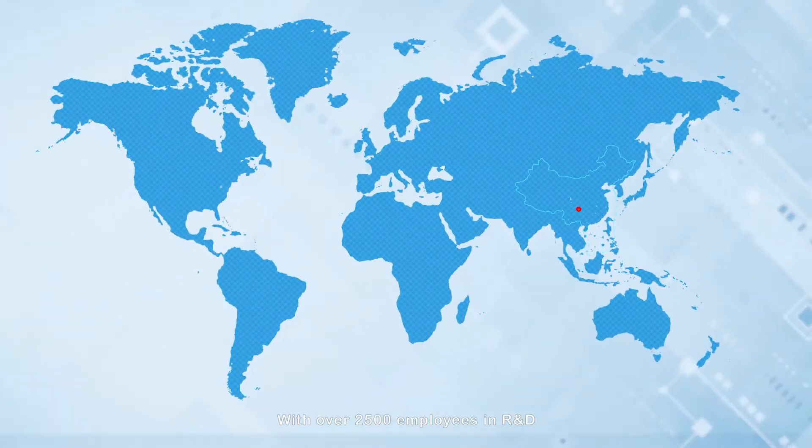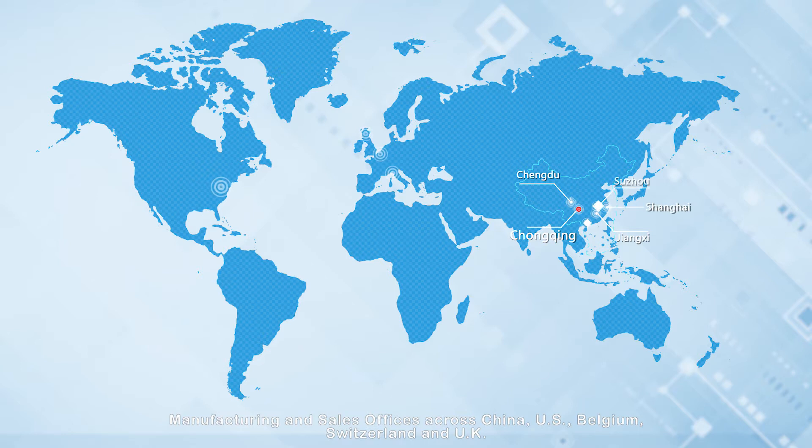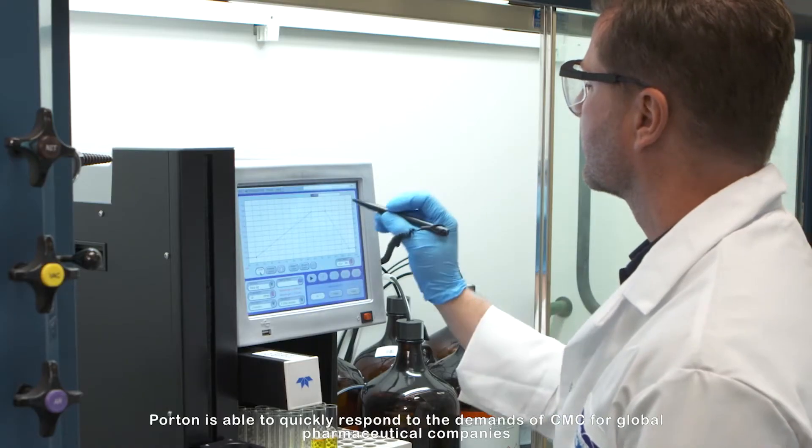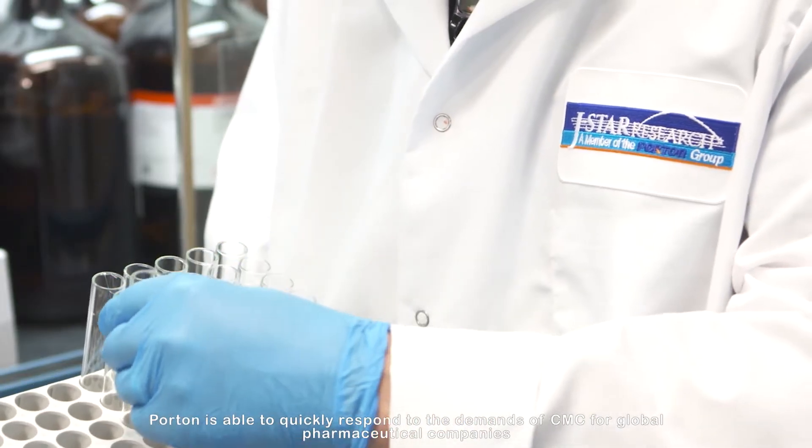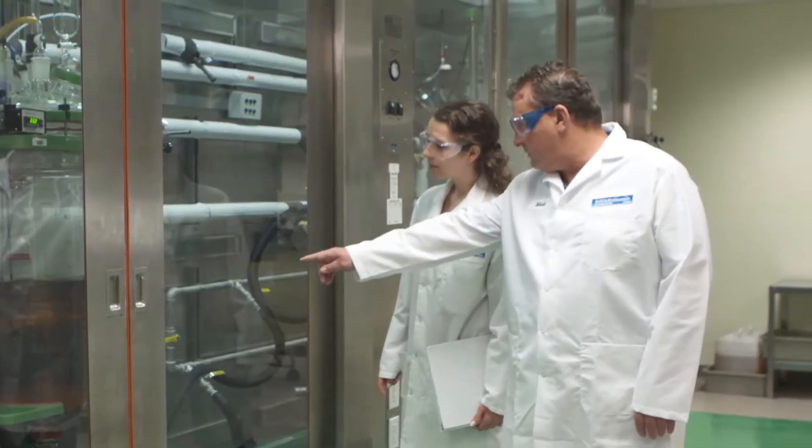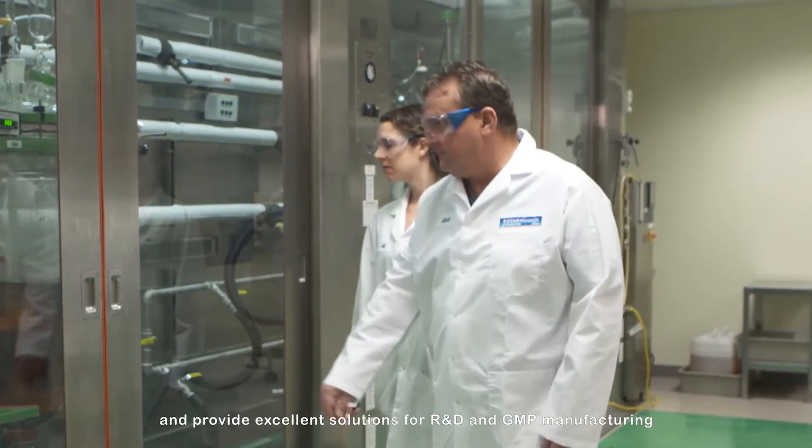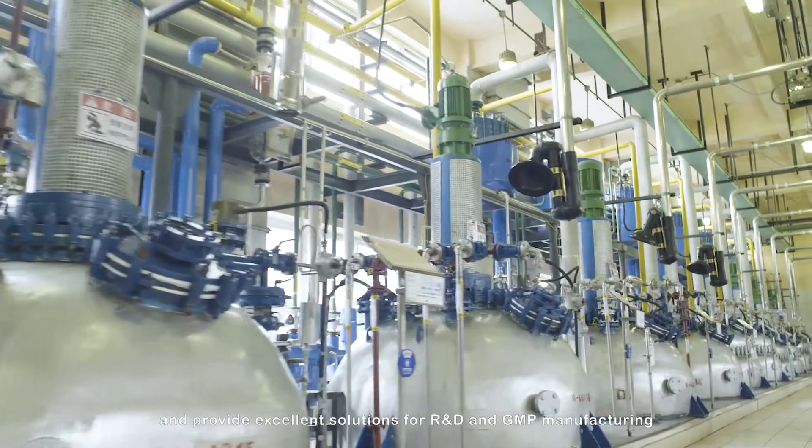With over 2,500 employees in R&D, manufacturing and sales offices across China, US, Belgium, Switzerland and UK, Porton is able to quickly respond to the demands of CMC for global pharmaceutical companies and provide excellent solutions for R&D and GMP manufacturing.